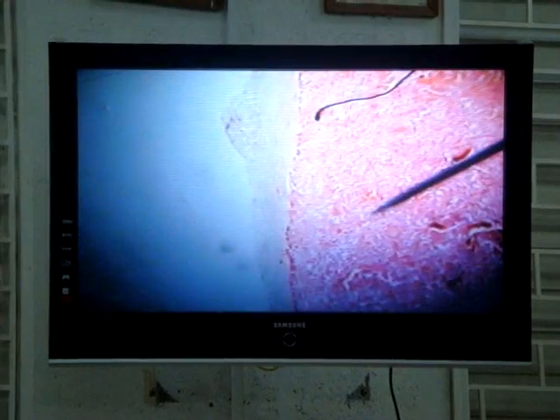But by and large, the two most important parts would be the pars distalis, which is this part here, and then the pars nervosa, which is that part. I also want you to observe that this slide we're looking at now is the H and E stained pituitary, hematoxylin and eosin. I'll be showing you two pituitaries; this is just one of them. I want you to observe too that this pituitary gland is invested in a well-developed capsule. That's the pale portion there.